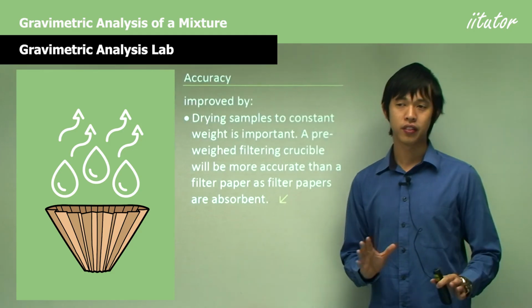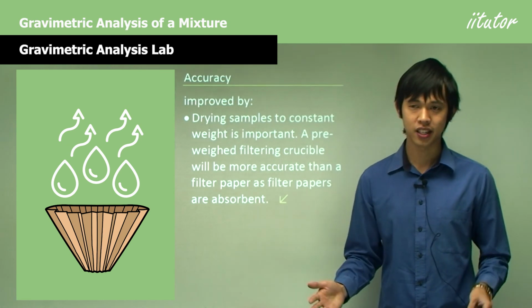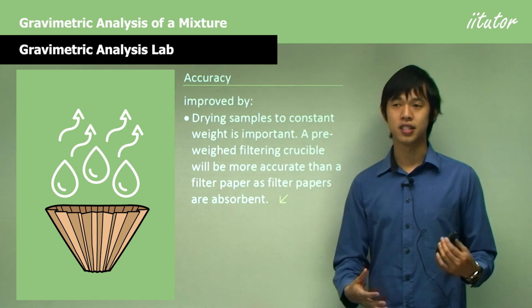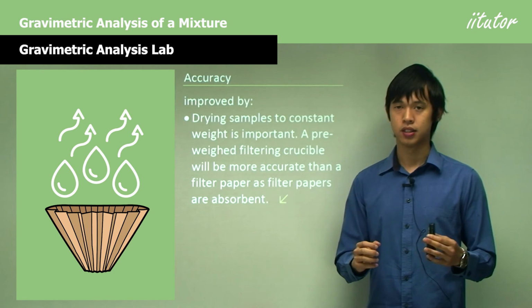We just have to be aware of that. Always play it on the safe side. Leave it for a couple more hours if really necessary. If you're really suspicious about it, just be aware of that. Things don't just happen instantaneously all the time. So you just have to be aware that the filter paper is completely dry.